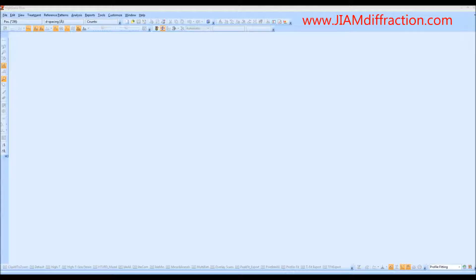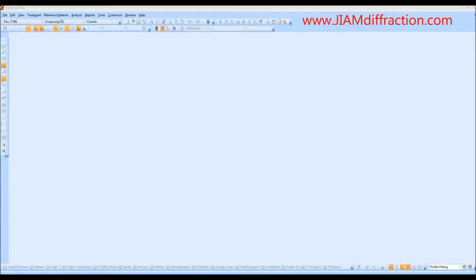The most common method of determining instrumental broadening is through the use of NIST standard samples, such as lanthanum hexaboride or silicon. These samples must be measured using the same exact optics as those used for your sample. I have already collected a diffraction pattern using the NIST 640e silicon standard, so the first step is to load the pattern.